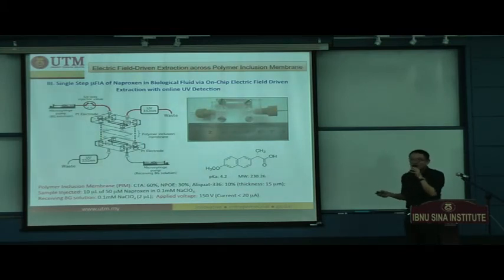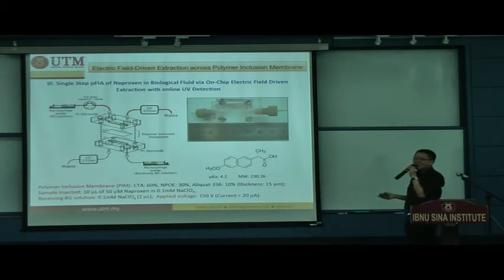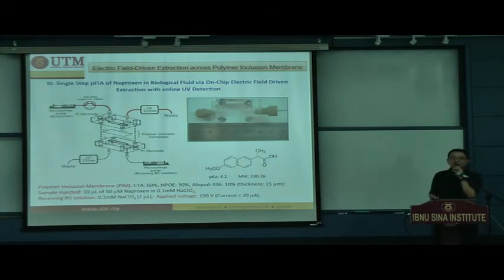This is a special UV for capillary electrophoresis. What you need to do is burn a window at the capillary and put it in, and the sample solutions flow inside the capillary, and the detection is actually contactless, which means you do it online. Yes, a very good question. This is not a normal UV detector; it is designed for capillary electrophoresis. Thank you so much for your answers.